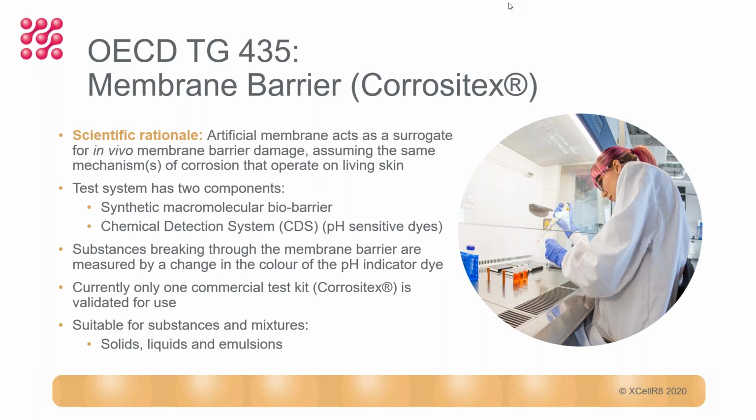Note that there's currently only one commercial test kit available for this particular method, so in a sense it's more of a simple decision compared with the skin model methods, and that method is Corrositex, but you won't see a reference to that in the guideline itself. This method also is suitable for substances and mixtures, and it's regularly used for solids, liquids and emulsions. Next slide.